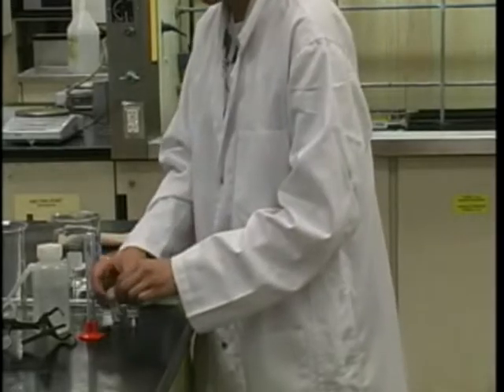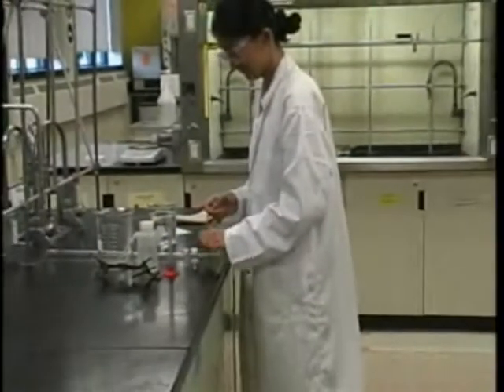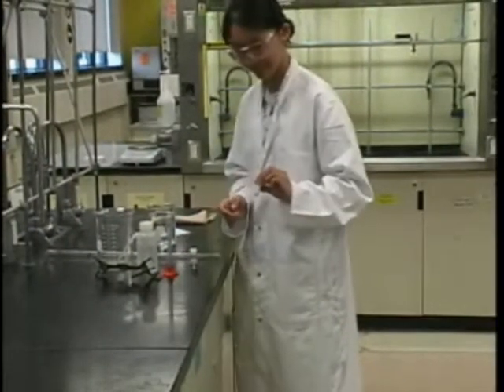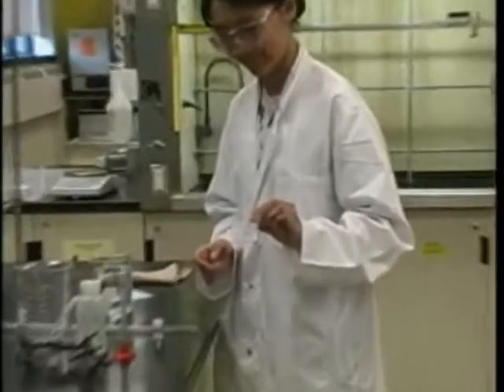The alloy is an unknown and will be labeled with a specific number. However, you must make sure you note down the unknown number of your alloy sample.